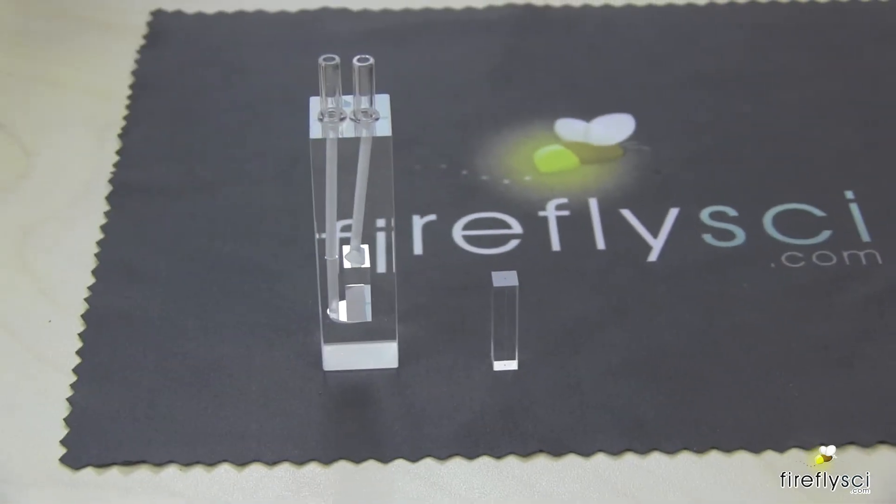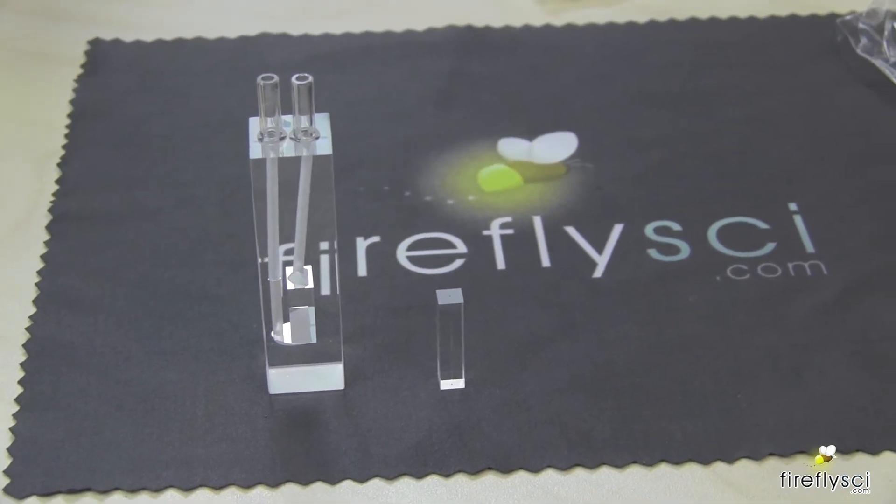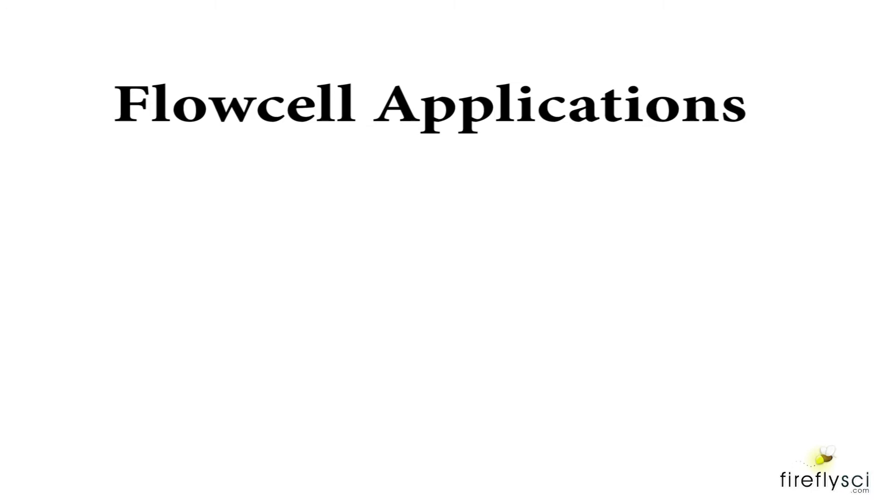Just to compare, here is the flow cell and here is that cuvette we were looking at earlier, next to each other. You can see how much bigger the cuvette is next to that tiny little flow cell.